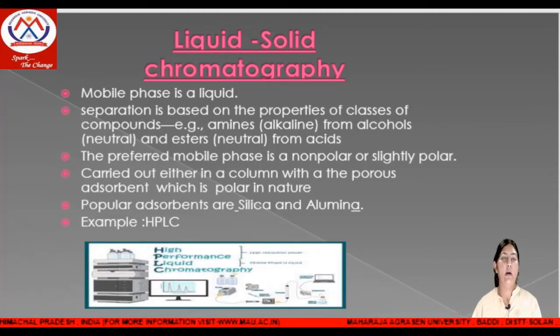The molecules are carried out in a column with a porous adsorbent, which is polar in nature. The popular adsorbents used in liquid solid chromatography are silica and alumina. An example of liquid solid chromatography is HPLC. Here we can see the representation of an HPLC system.